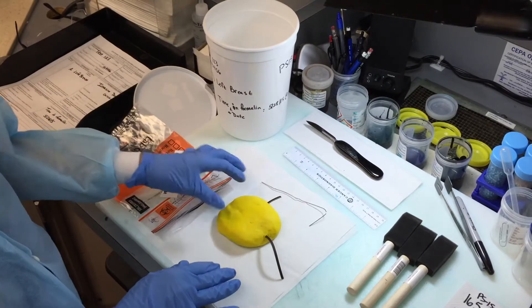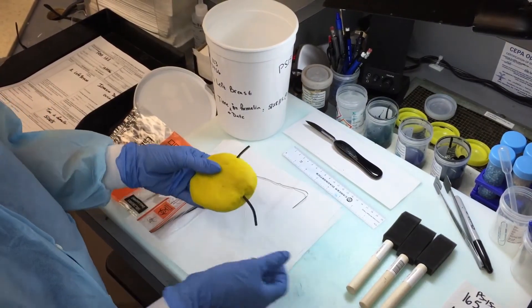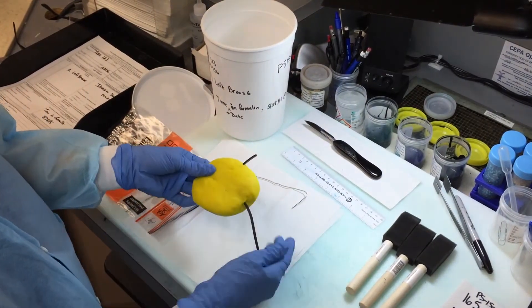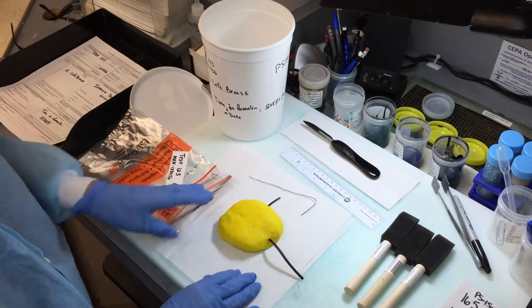So we have three sutures. We have the short, which designates the superior aspect, the long designates the lateral aspect, and the double for deep. And this is a left breast, so this is the correct orientation.